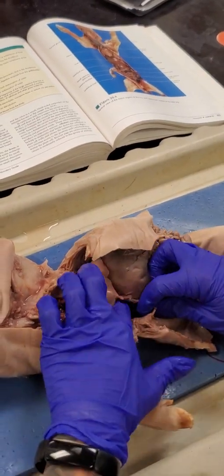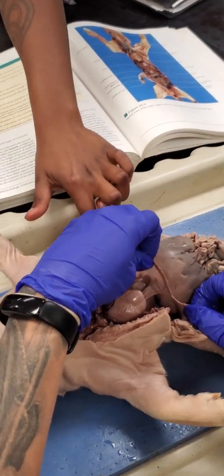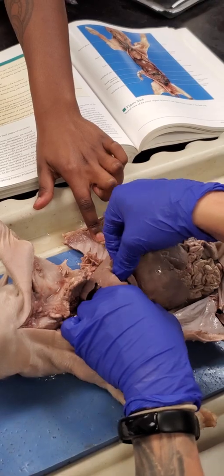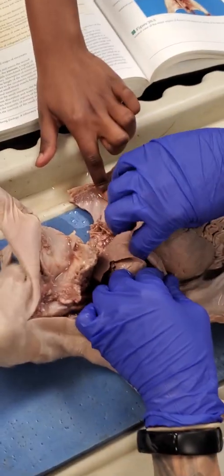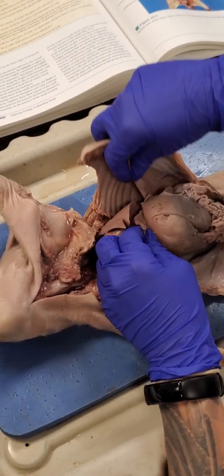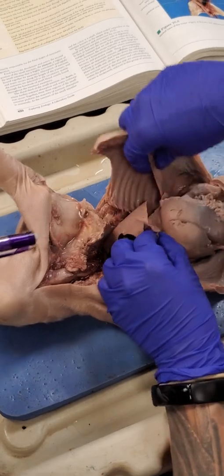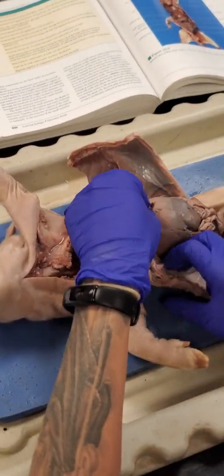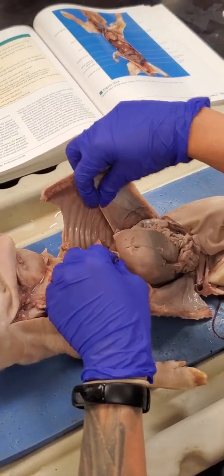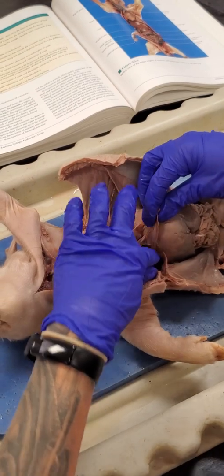I really want you guys to pay attention to this part. So see how it's all connected right here? And you see how the lungs right here are separated by the diaphragm from the liver. So all of this was connected at one point, and then I cut through that diaphragm to separate these two body cavities. So that's the diaphragm? Yep, this flap is the diaphragm. It basically separates these two sections of the body cavity.